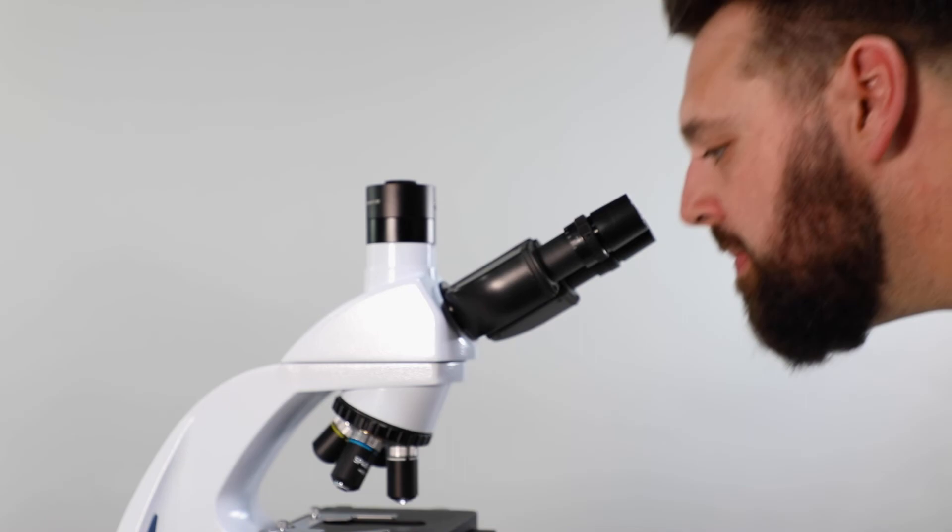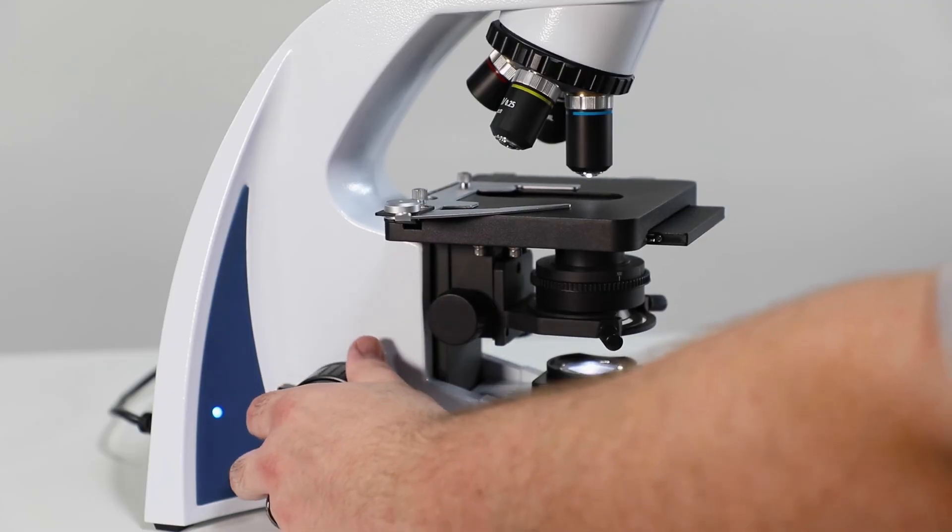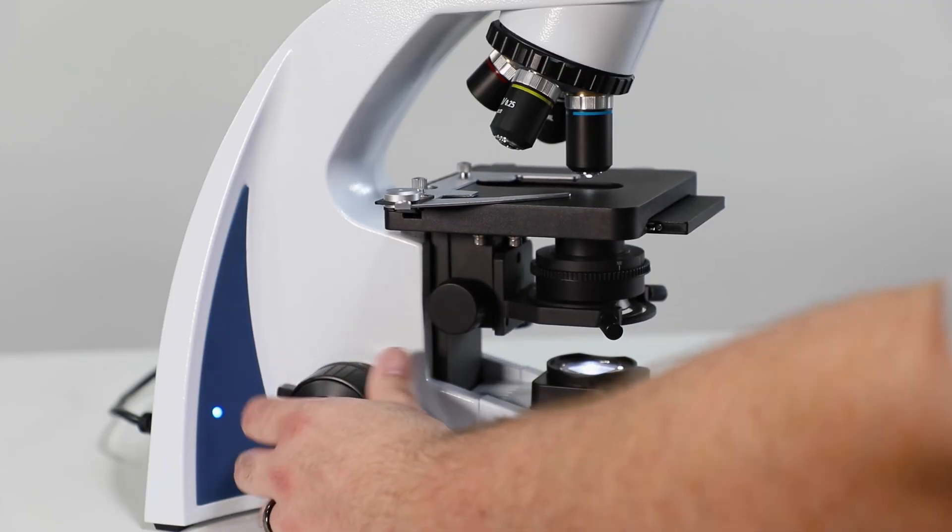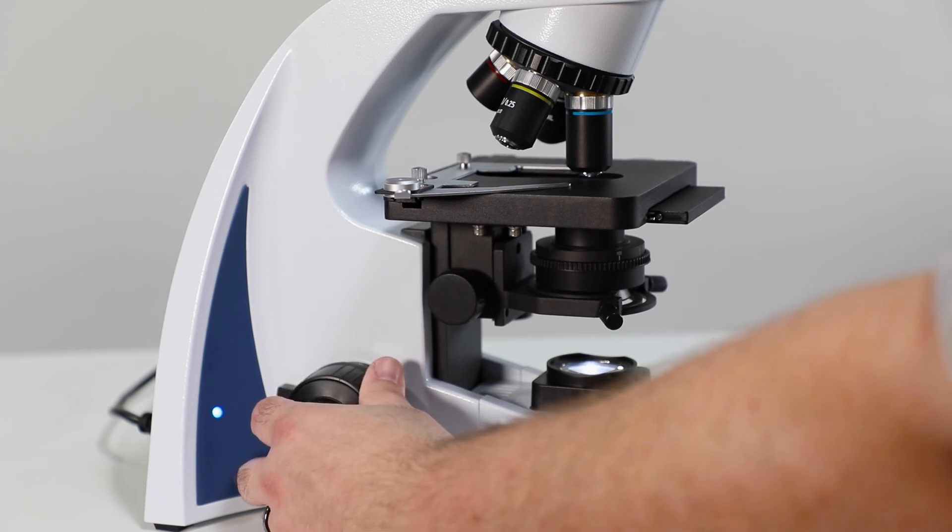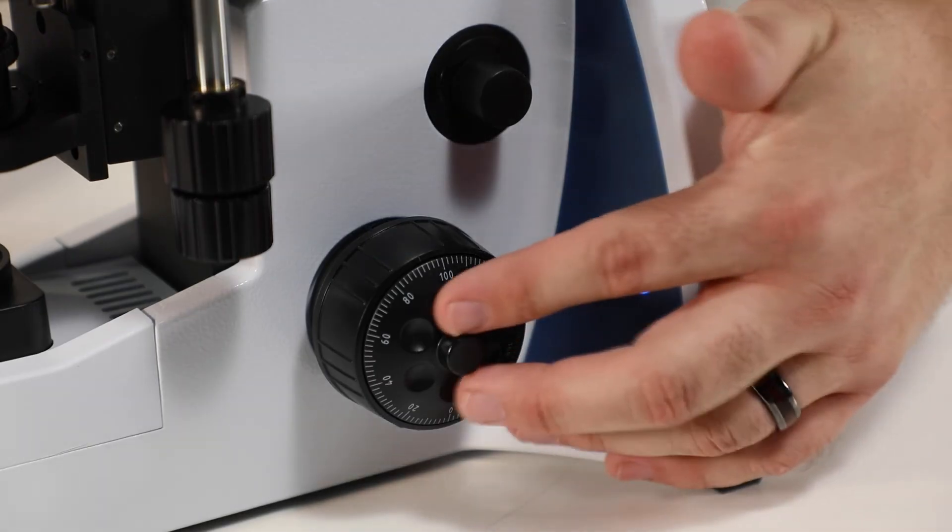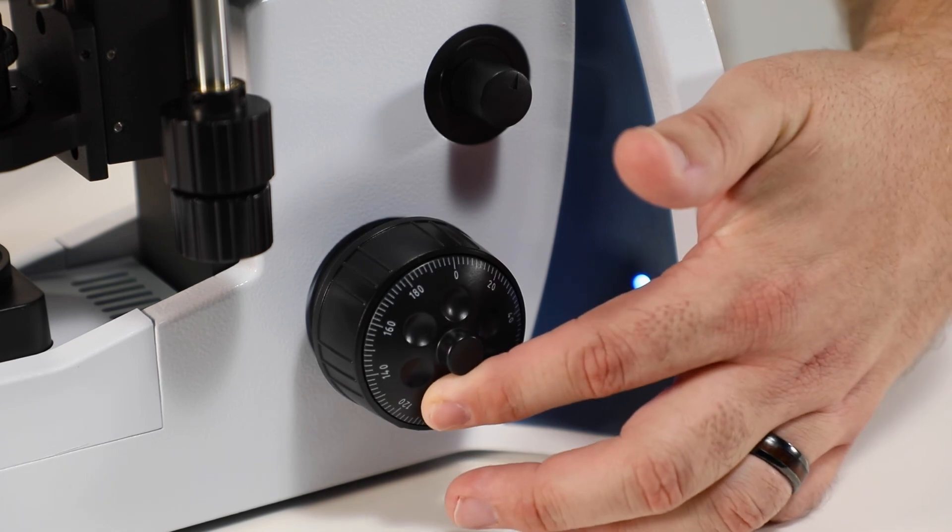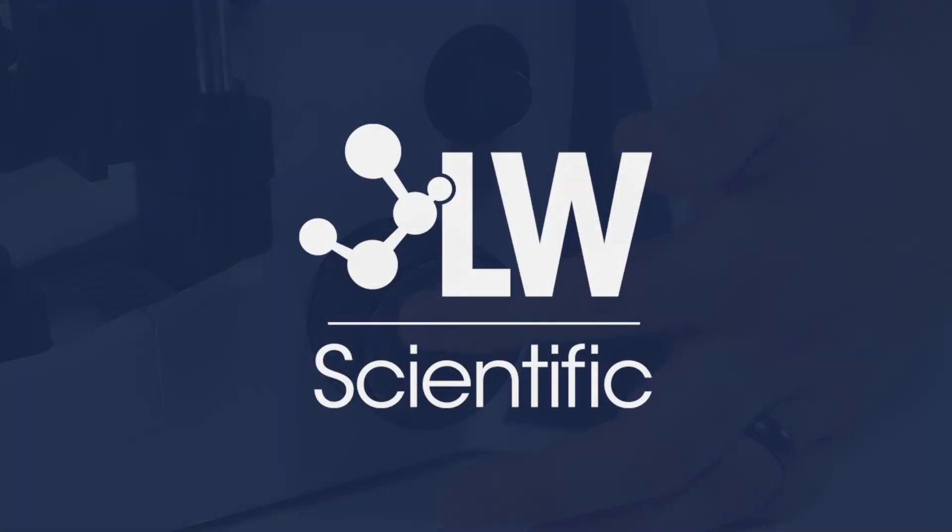While looking through the eyepieces, slowly turn the course adjustment knob away from you to raise the stage until your subject is as close to focus as possible in your eyepieces. Then use your fine focus knob to adjust the image until it's completely clear. Now your stage height is set and you're ready to go.